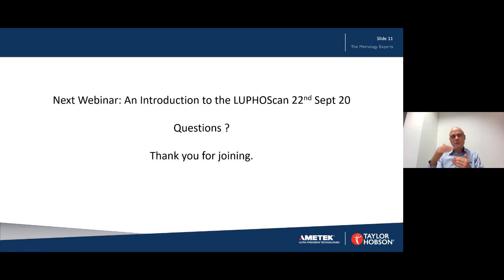That's quite simply done by setting up what we call a template and choosing to run that template as the results engine for the measurement in the PGI Optics. It's quite a seamless process. Once it's set up, you wouldn't have to reopen Talymap and reanalyse. It can all be done for you. Okay, so hopefully that answers that question.